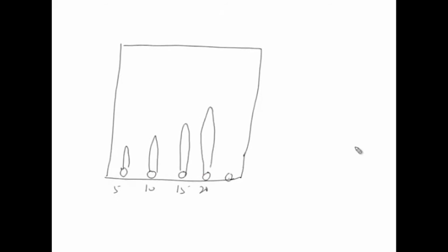pattern, and like in chromatography, the heights of the peaks will give you the concentration idea. And so, the unknown could be found out. If the unknown is at this height, then through a calibration curve you can know the unknown. So, this is called rocket electrophoresis because of this pattern.